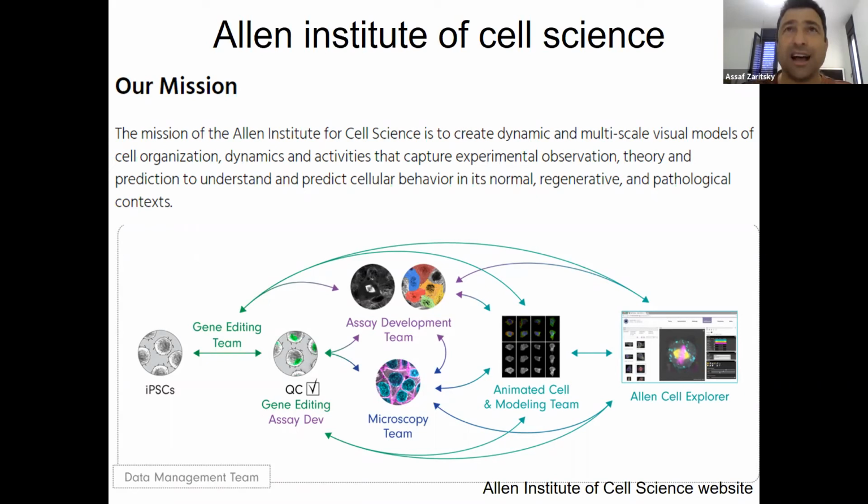They are imaging tons of high quality 3D images of the cells under different conditions and different organelles fluorescently labeled. So they are making huge amounts of microscopy data that is publicly available and is really high quality. And you can use it to develop tools, to ask questions, to visualize, and just stare at these images to gain some insight. They are developing computational tools and letting the field use them. So I think the impact is significant.